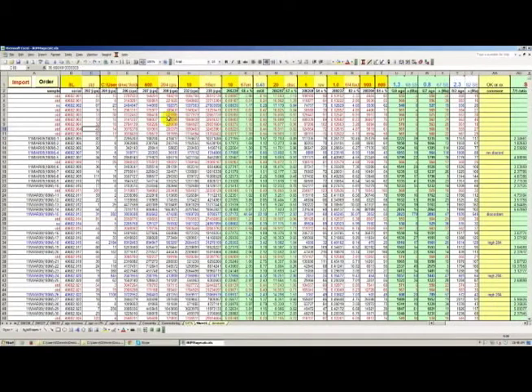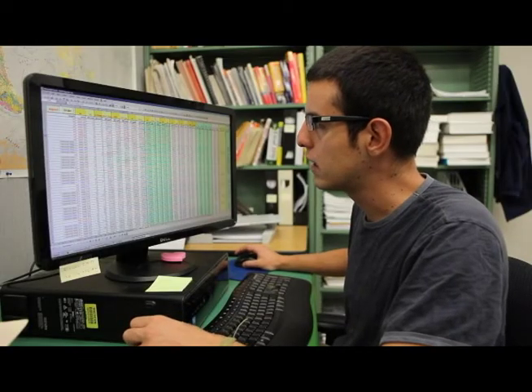So as I told you before, once you click XX here, or you type XX in the labeling of an individual grain, this line is going to turn blue, right? Because there's a filter in the macro that is telling the program that if there's anything here labeled XXX, it's going to turn blue. And there's also something, if you look at analysis number 4 down here, that the whole line is blue. And that is because we have some thresholds that are being applied to the data to just filter or highlight the problematic individual analysis.